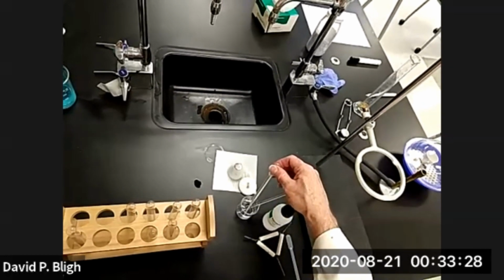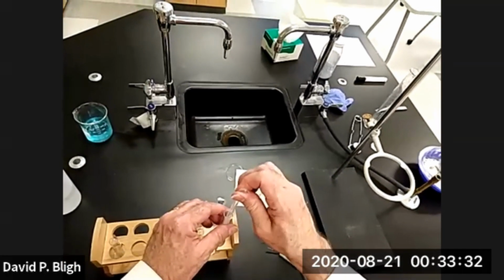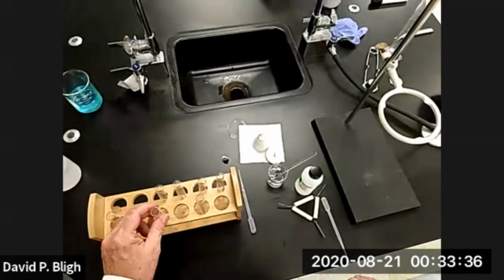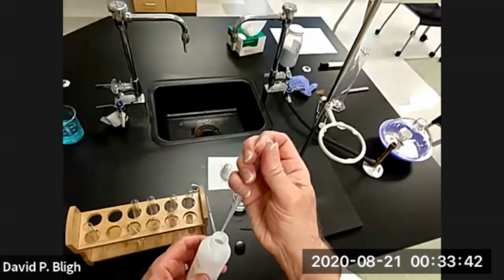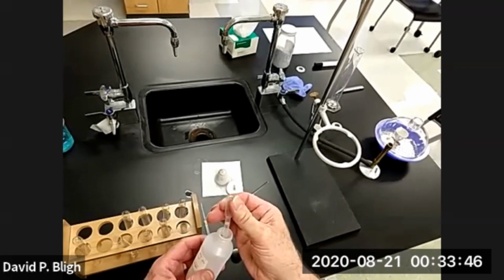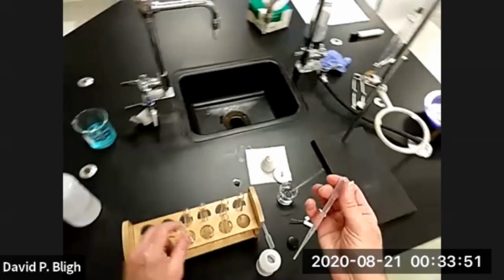There we go. Bottom of the bulb into there. Now I need to do the same thing with the hydrochloric acid. There we go, perfect.